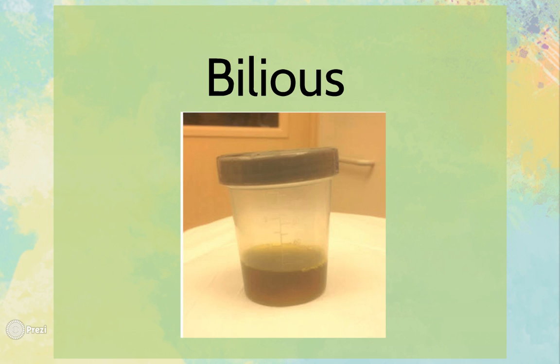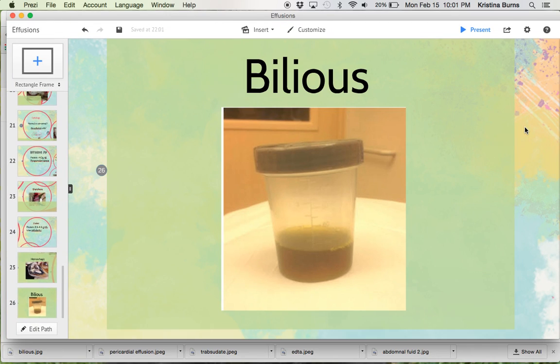So our goals as RVTs in all these cases is to help the veterinarian take the fluid out of the abdomen or the thorax, which a group project will probably talk about, and then know how to prepare the fluid, know how to look at the fluid, stain it, and start identifying cells that might be familiar, and help the vet in determining a diagnosis through our diagnostic process. So through our laboratory work, we then provide that to the veterinarian, and they can decide what's going on and rule out some potential diseases.